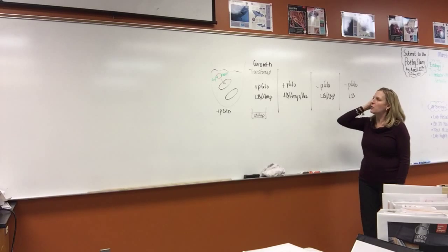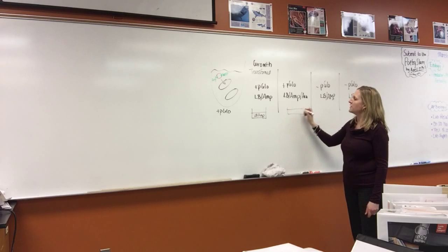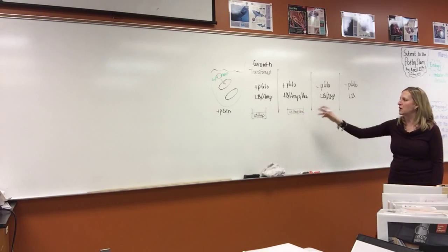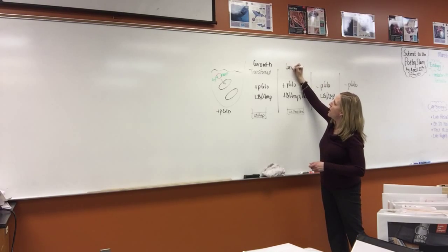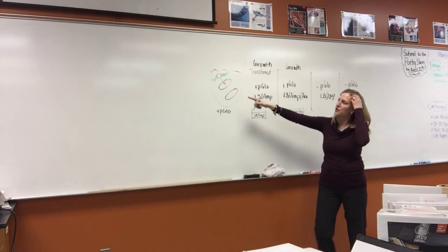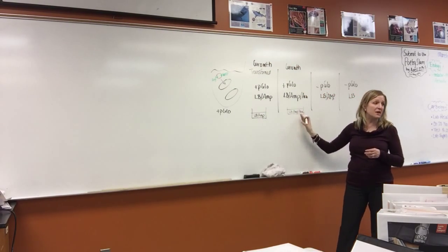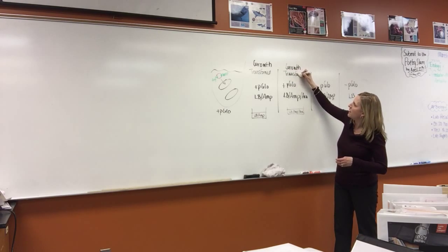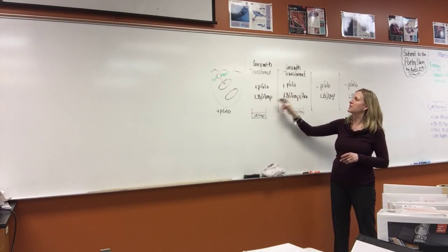So then, the second one was the positive pGLO with LB, amp, and ara. So the only difference between this one is that it has arabinose in addition to LB, which is the food, and ampicillin, which is the antibiotic. So in this one, you should have also seen growth. And for the same reason, for this one, you took 100 microliters and put it in here. You put transformed and non-transformed bacteria, but you should have only seen growth of the transformed bacteria. And the only difference between these two is the arabinose.